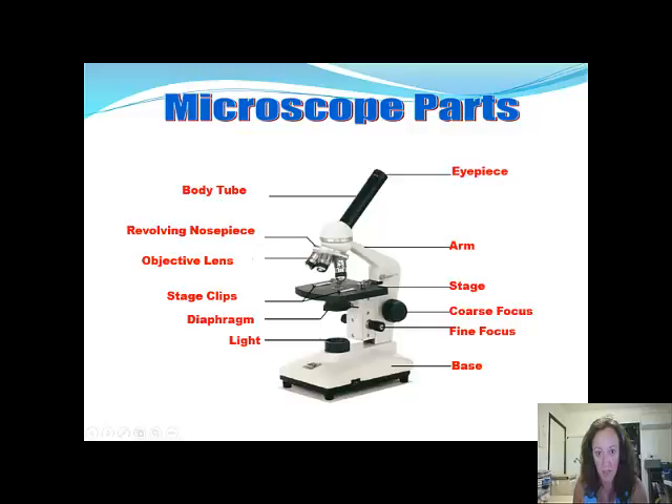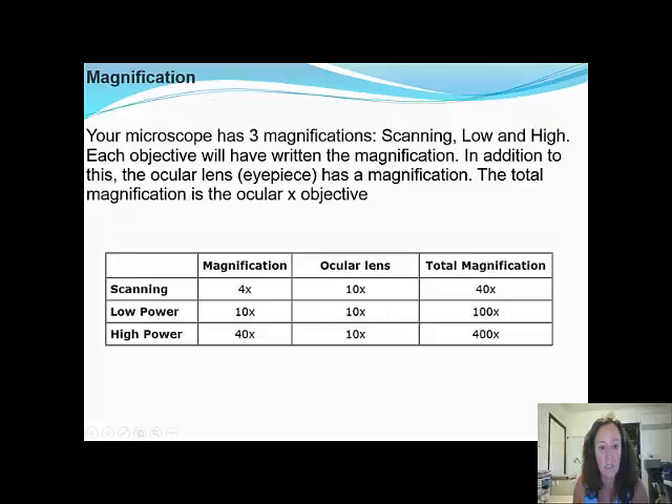These are called the objective lenses, and this is the revolving nosepiece. Your microscope has three magnifications: scanning, low, and high. Each objective will have the written magnification on it. In addition, the ocular lens or eyepiece also has a magnification, and you multiply them together to get the total magnification.